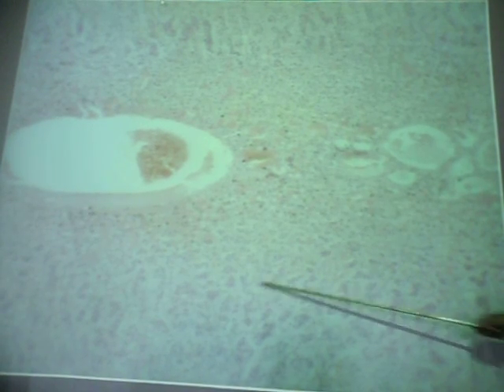There's the medulla. Here again is the zona reticularis of the cortex. Here again is the zona fasciculata here. Okay? And then here again is the zona glomerulosa. And here's the capsule again. So we're just going through the organ, one side to the other. Okay, that was confusing.